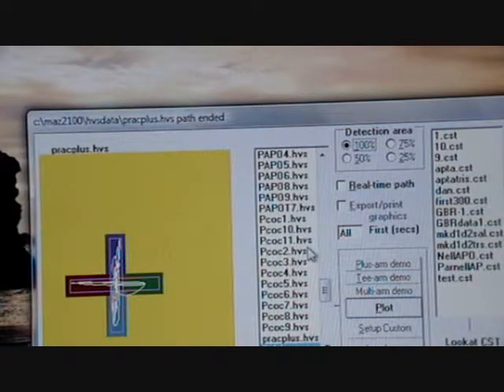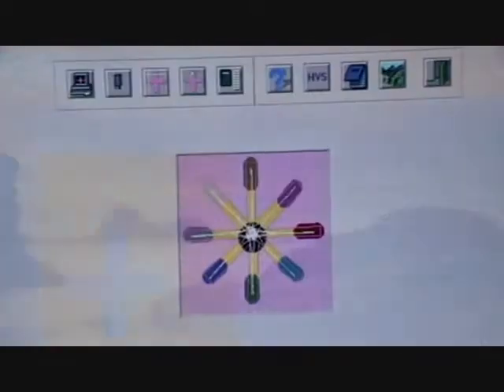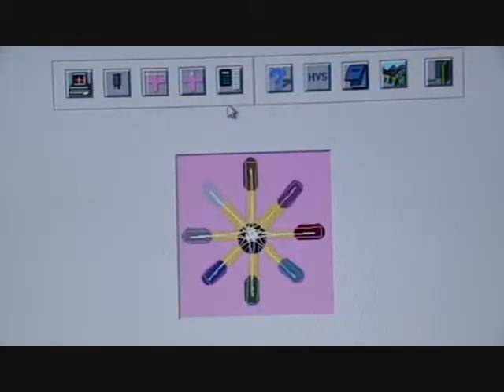So we'll close that. And then we can also get the CST file out of here. And if we need to, we can look at that more in depth through SPSS or Excel. So we're going to close that. And there's other ways that we can actually analyze these data. We were able to get a time by time analysis so that we can actually look at when they went into the arms within 5-minute time periods for our 10-minute test that we use for our experiments. So it does provide a lot of good information in terms of how much the rat is moving.